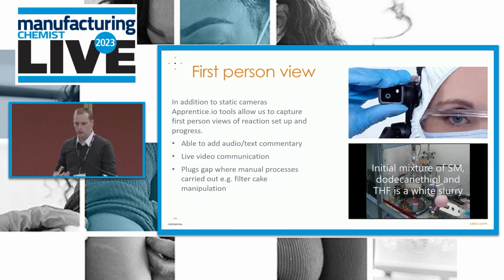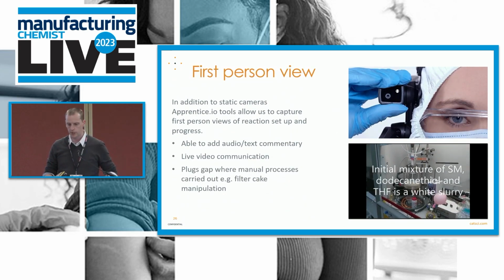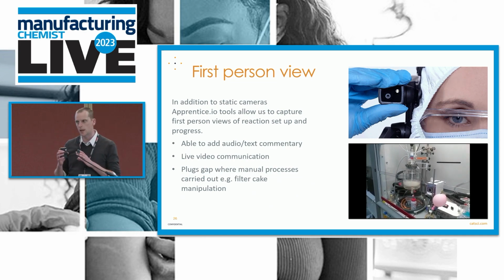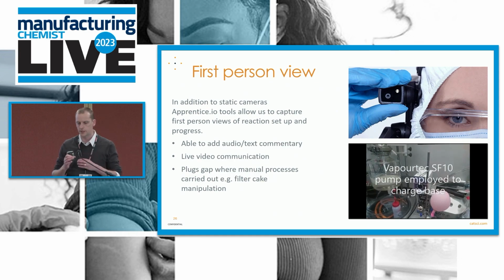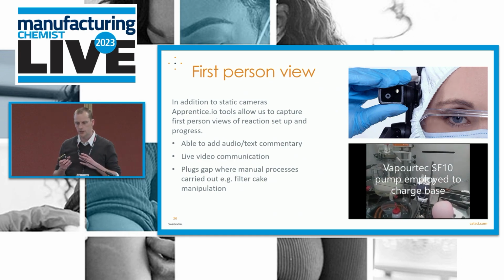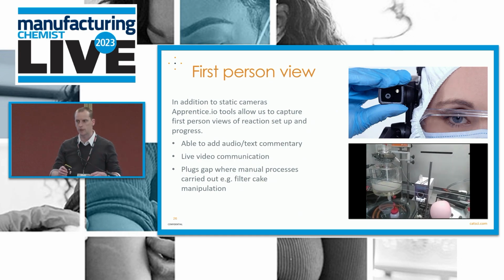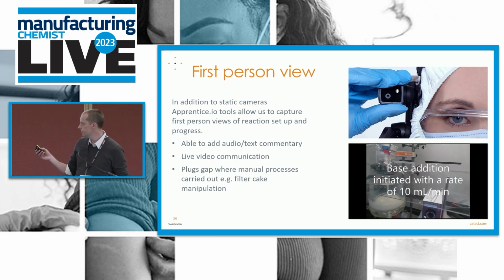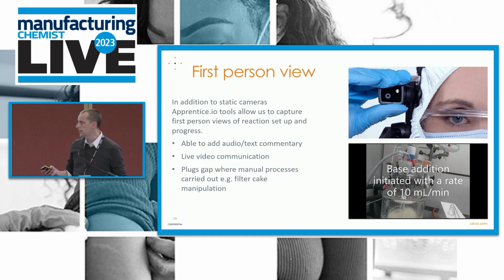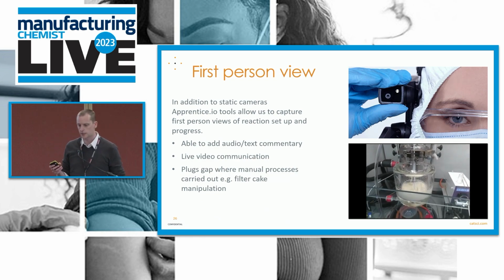We have one other tool which kind of bridges the gap between those static cameras and showing what a chemist is doing with their own hands. So this is particularly useful when you're doing manual manipulations. This is a product from apprentice.io, I think an East Coast US-based startup.